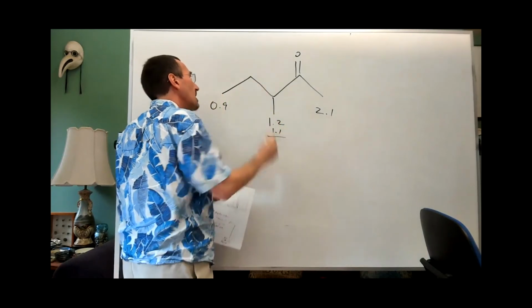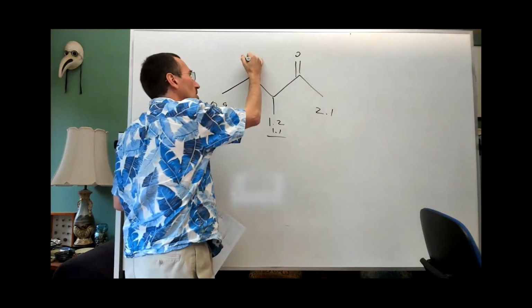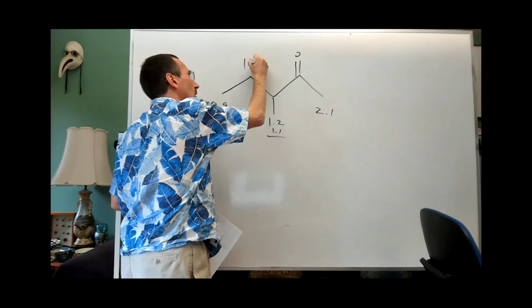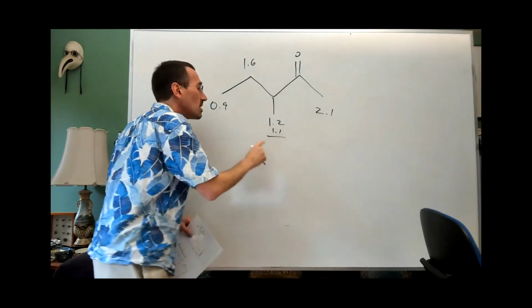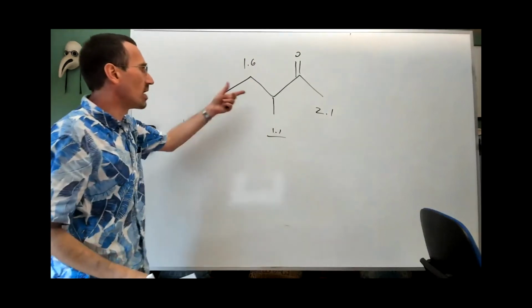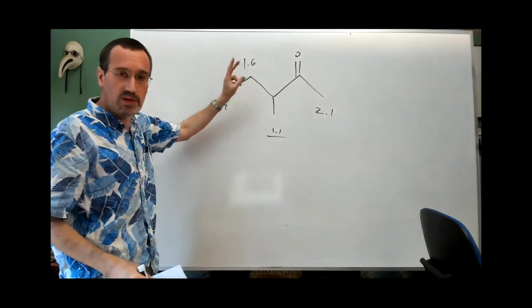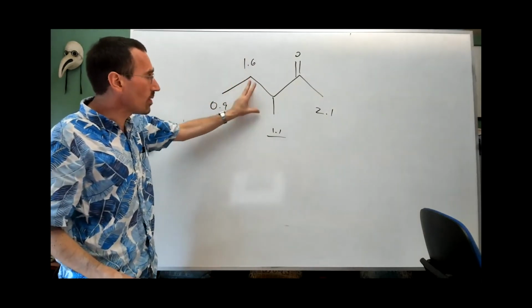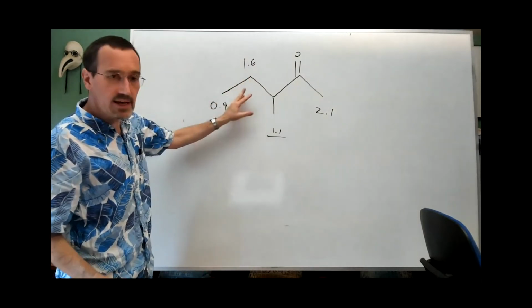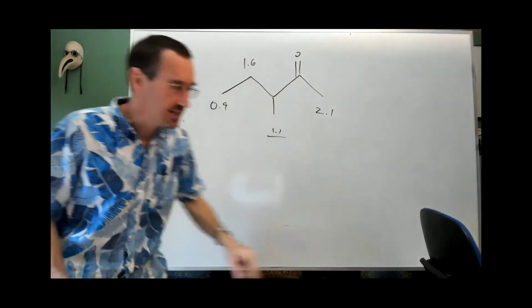And a methylene group that's beta to a ketone is going to be somewhere around 1.6. So these would be my estimates. I'll go with 1.1. I'll say we're adding 0.2 here. You could say 1.7. And that's a great estimate. This is what ChemDraw is going to give you, and I know because I just did it last night.